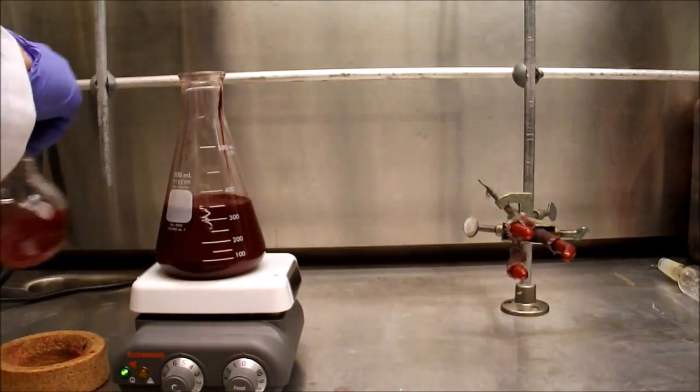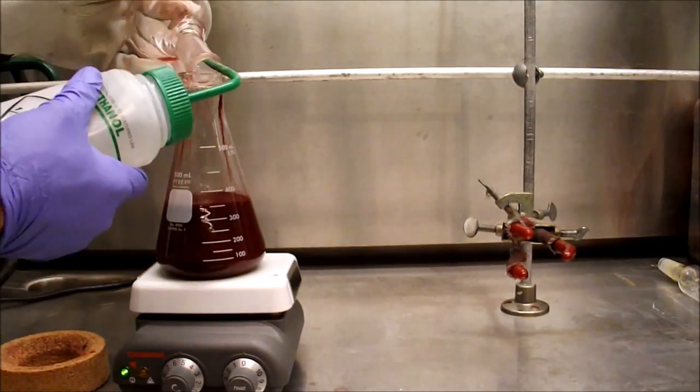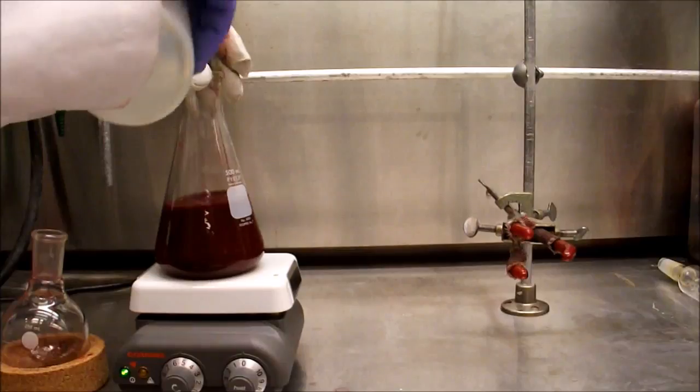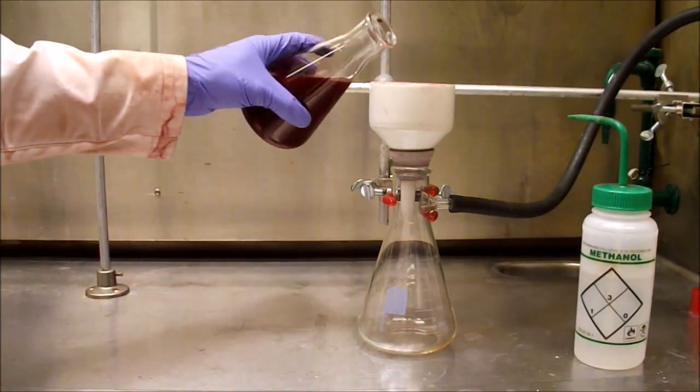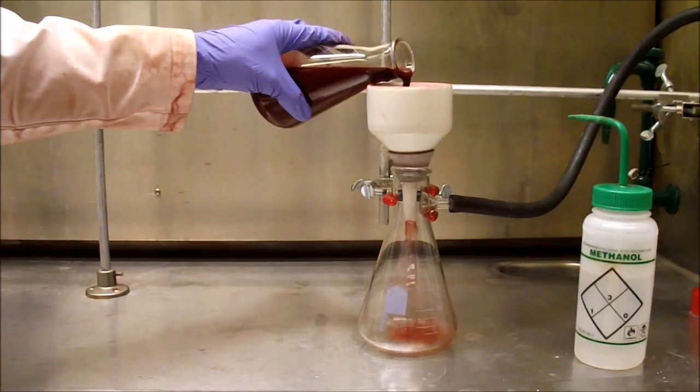After the reaction mixture is fully transferred to the Erlenmeyer flask, the methanol mixture is allowed to stir for a couple hours. Stirring the PDI in methanol allows the PDI to clump up, which makes filtering significantly faster.